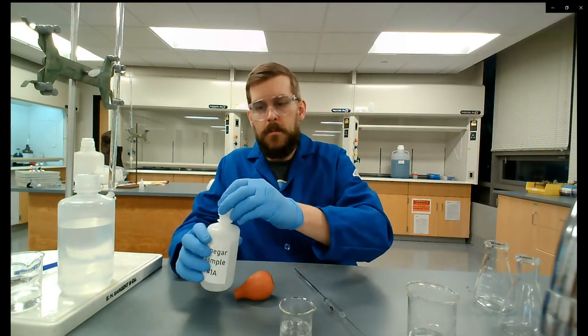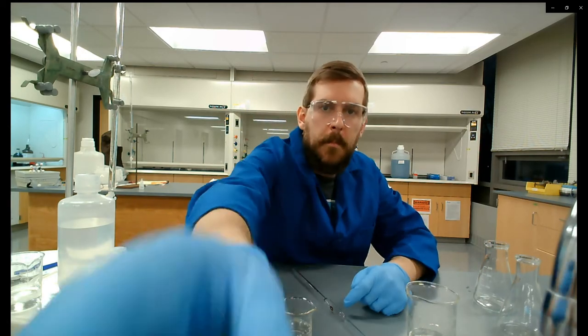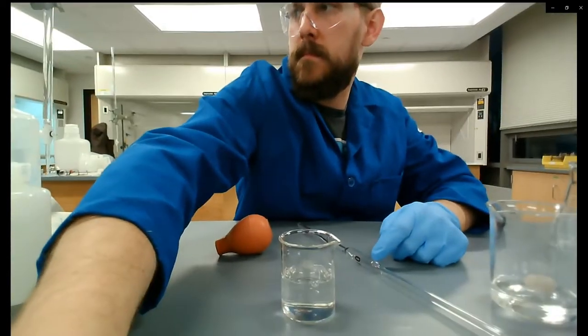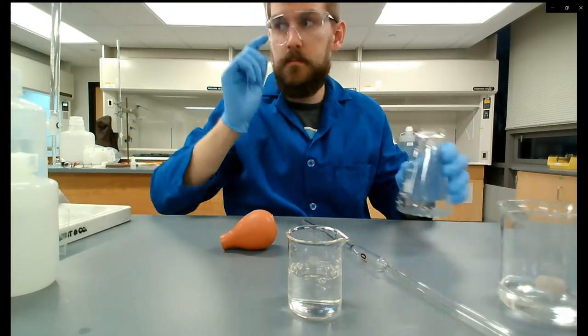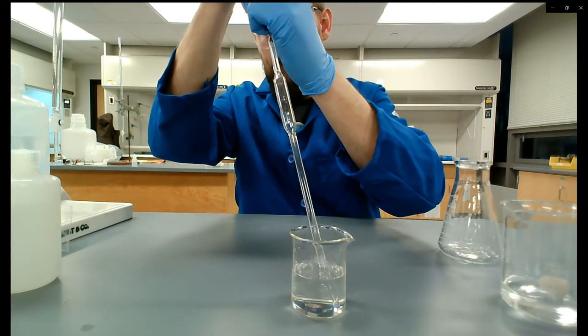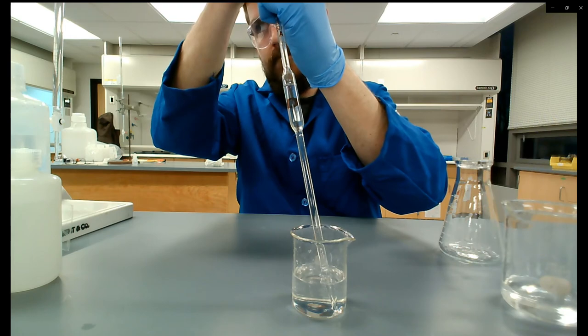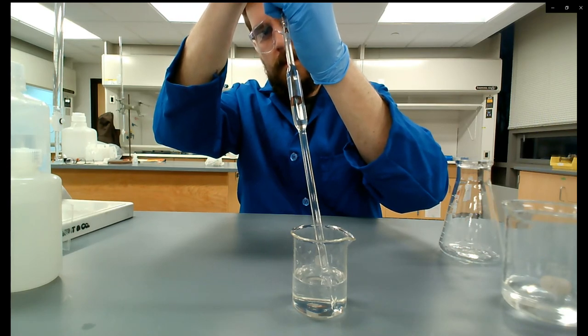I poured probably 50 or so milliliters — no need to be excessive. Each titration uses 10 milliliters and I'm doing four titrations, so I shouldn't need more than 50 milliliters. Now I'm pulling the vinegar sample up past the 10 milliliter mark on the volumetric pipette.